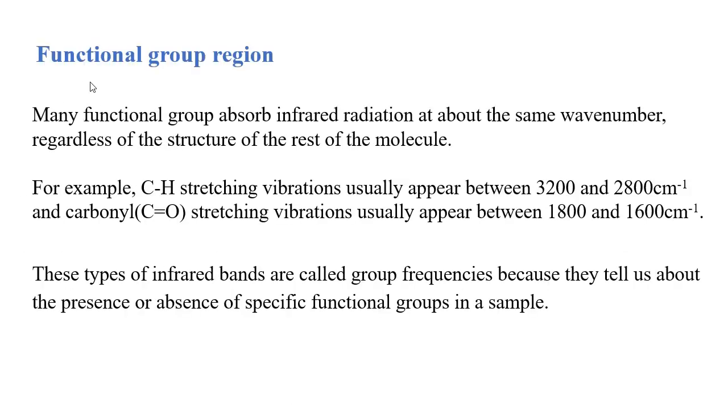Now let us consider the importance of the functional group region. Many functional groups absorb infrared radiation at about the same wave number, regardless of the structure of the rest of the molecule. For example, C-H stretching vibrations usually appear between 3200 and 2800 centimeter inverse.